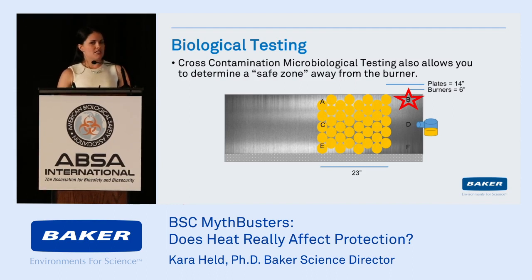When we did the cross-contamination test, we also set this up so that we could get an extra little bit of information. So on the right-hand side, you see the nebulizer that is spraying bacteria across the length of the biosafety cabinet. Each of those yellow circles represents a petri dish, and then the Bunsen burner was placed in the back corner at B. And the NSF testing dictates that you start the petri dishes at least 14 inches away from the nebulizer, because within 14 inches, there should be some spreading, but beyond that point, you should get no colonies. And up to at least 23 inches away, when we stopped putting the plates out, we were still seeing contamination that far away from the contamination source.